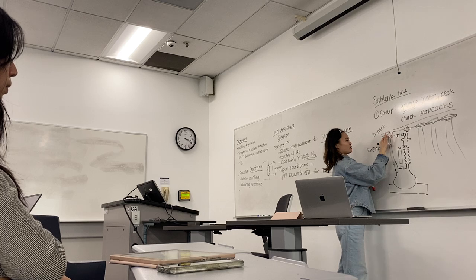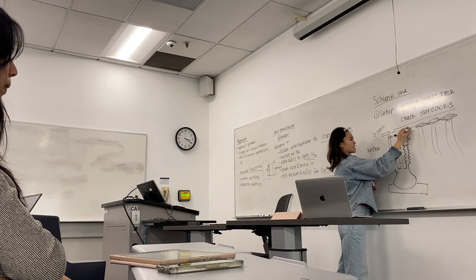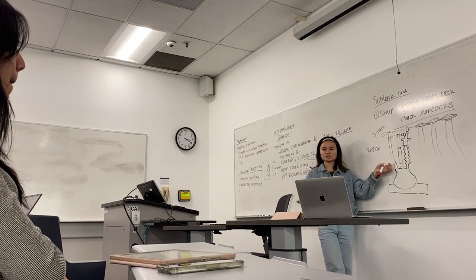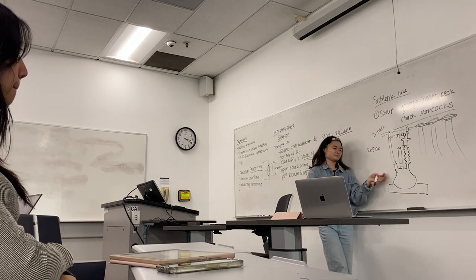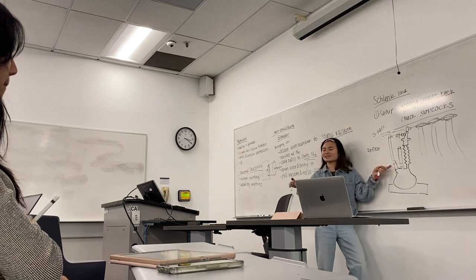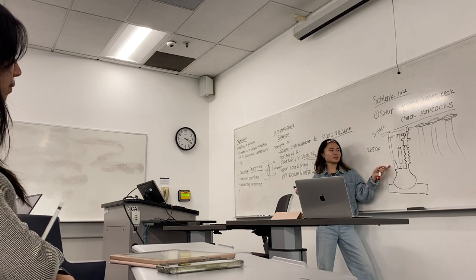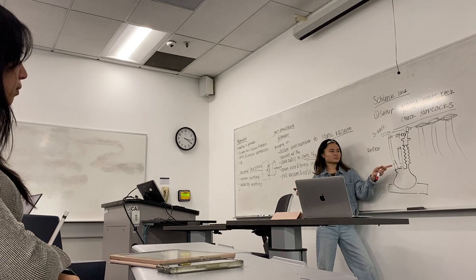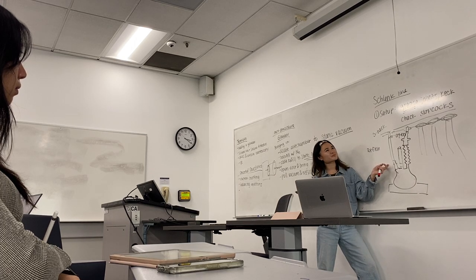So you have 2 lines. We always had one of the lines connected to the condenser, and we always had something connected to a nitrogen inlet. This is a really bad nitrogen inlet, I'm sorry guys. A reason we always had a nitrogen inlet is if we needed to, well, in some instances, so, I'm not explaining this very well.